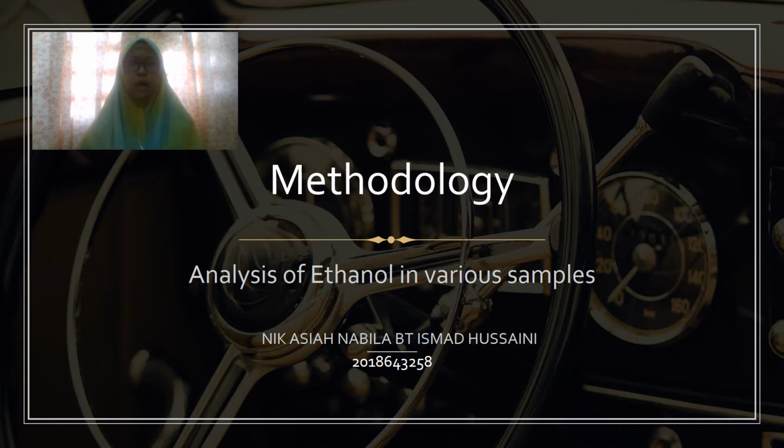Now, we will look at the methodology for the gas chromatography experiment. In this experiment, we will analyze ethanol in various samples. We will use ethanol as the analyte and 4 different samples, which are whole blood, whiskey, beer, and wine.